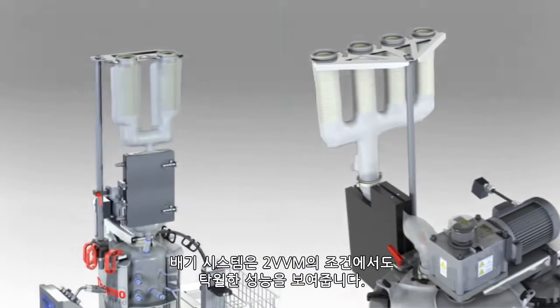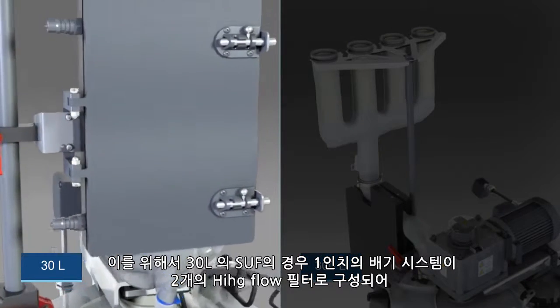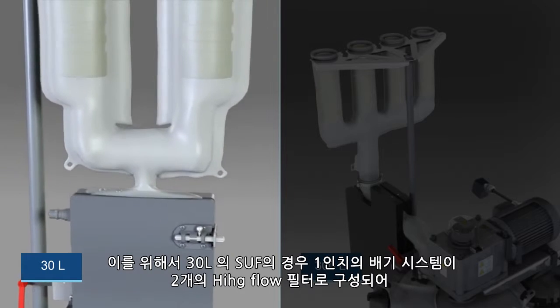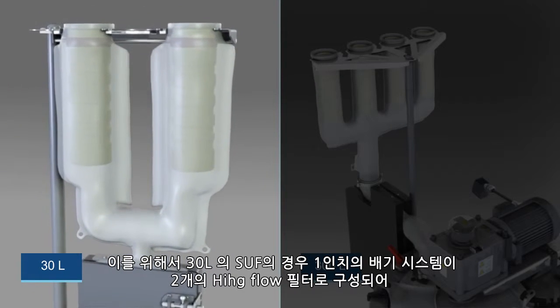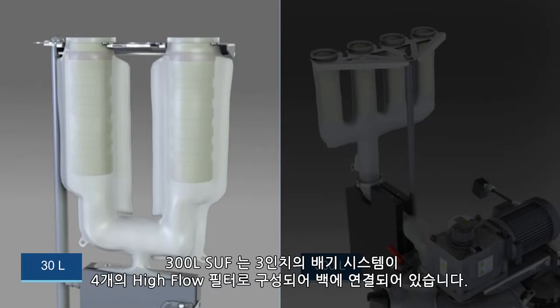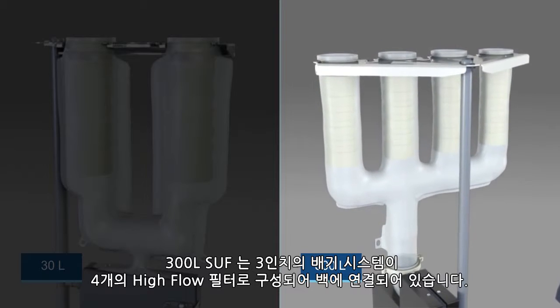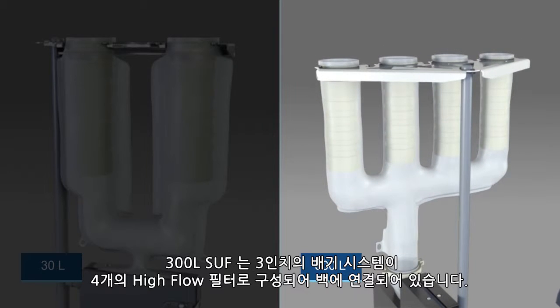Both exhaust systems provide superior performance at 2 vessel volumes per minute. The 30-liter SUF accomplishes this by using a 1-inch exhaust port attached to a high-flow filter bag that can be configured with up to 2 filters. The 300-liter SUF accomplishes this by using a 3-inch exhaust port attached to a high-flow filter bag that can be configured with up to 4 filters.